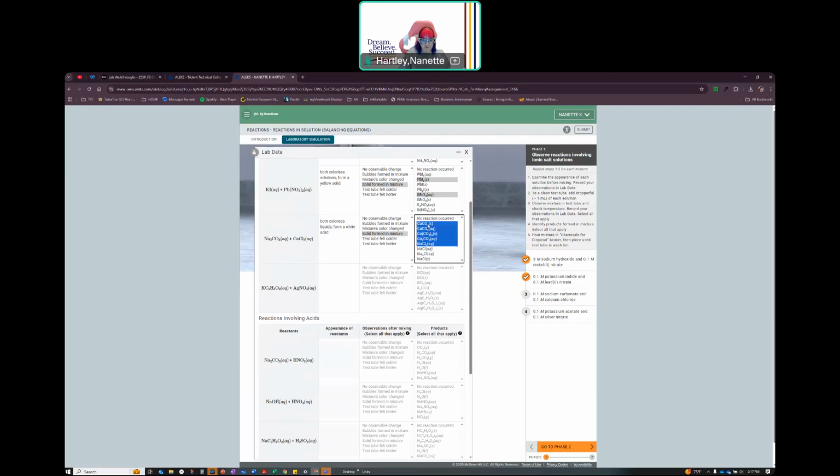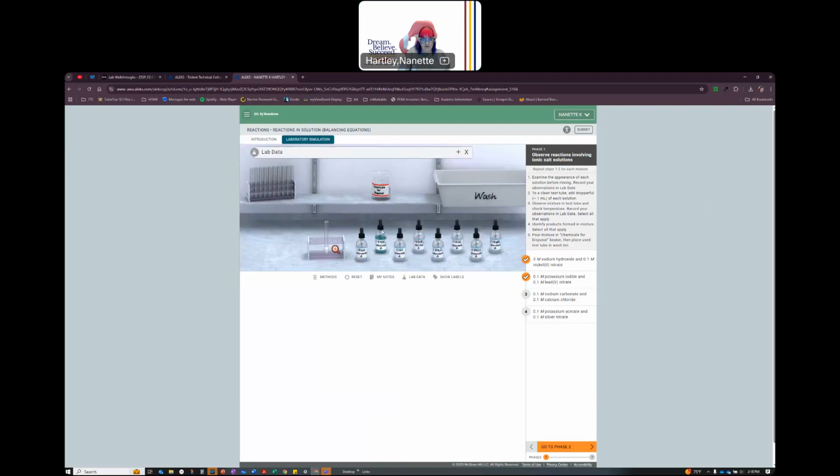Okay, so CaCO3 solid and NaCl aqueous. Come out here, zoom out of this, dispose of that, and I'll get rid of that.